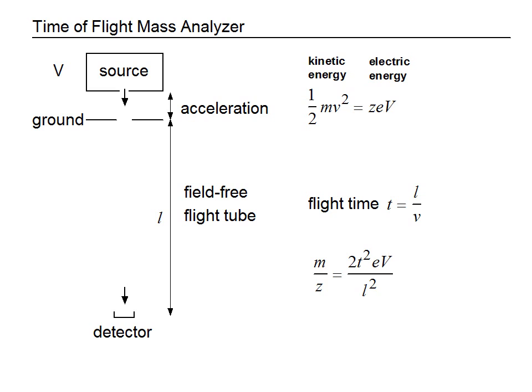The source on the top is thus the MALDI source, where ion packages are generated. These ion packages are accelerated in a strong electric field of about 20,000 volts through a hole into a completely empty tube, the so-called flight tube. This tube has a very high vacuum of 10 to the minus 10 torr and a fixed length. It is also a field-free flight tube. That means there should be no electrical or magnetic fields that could deviate the ions. Essentially, there should be no effect on the flight of the ions by collisions or external fields.